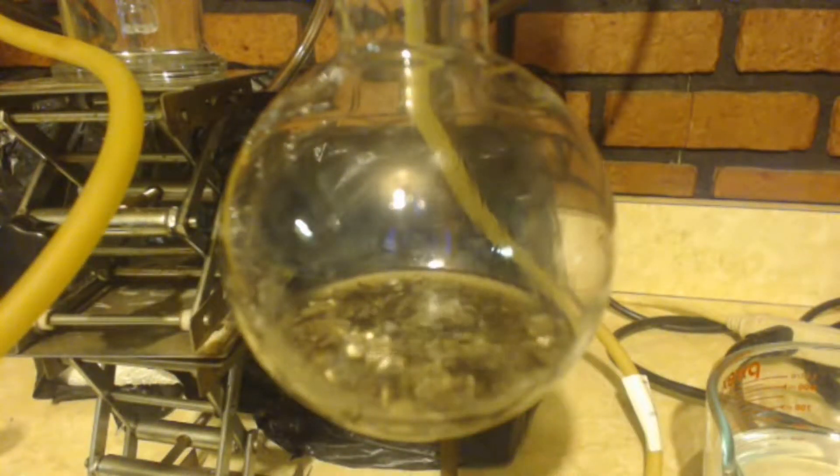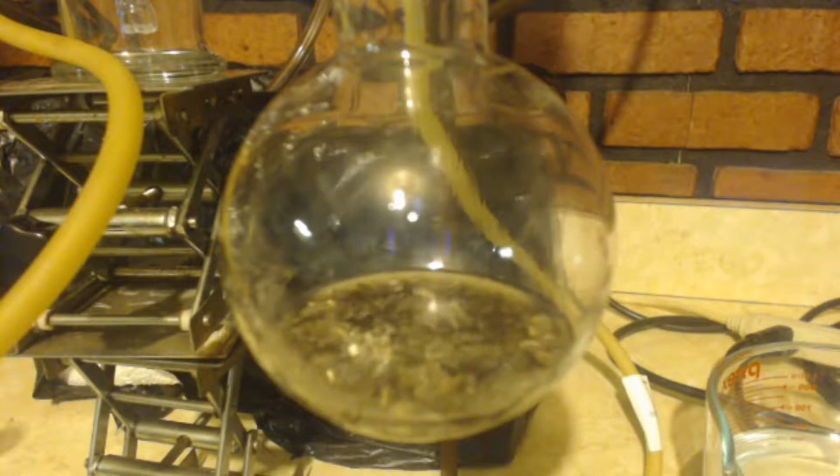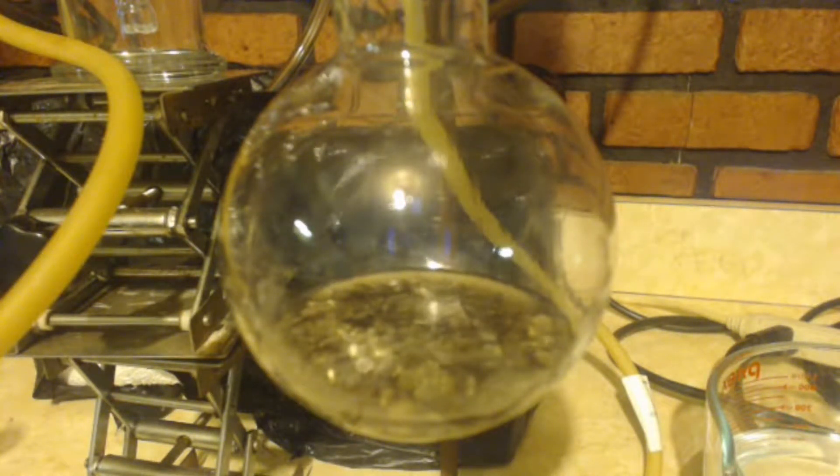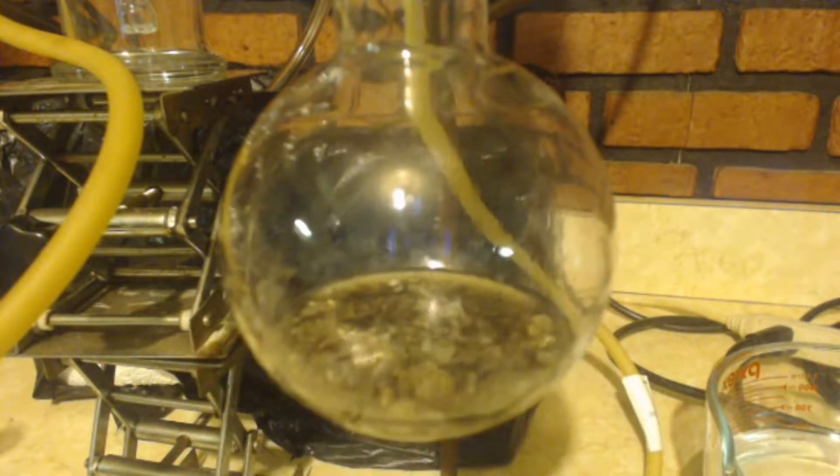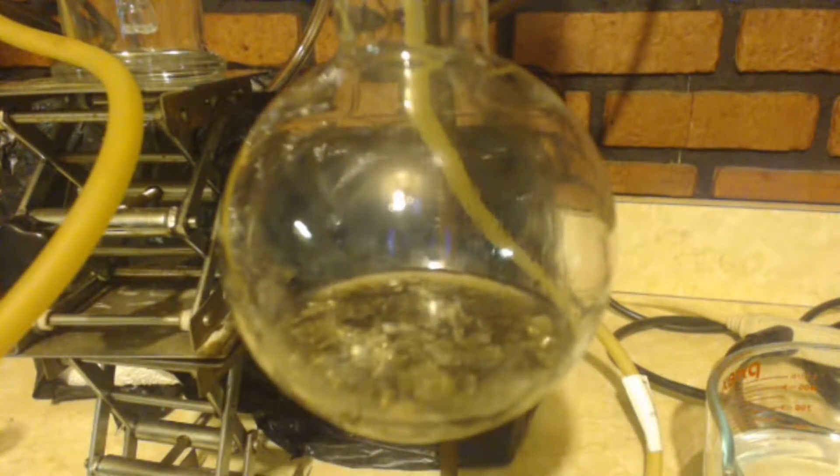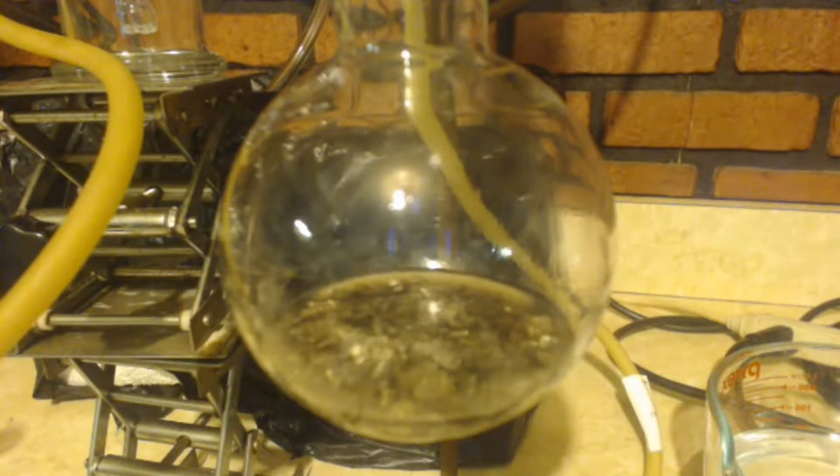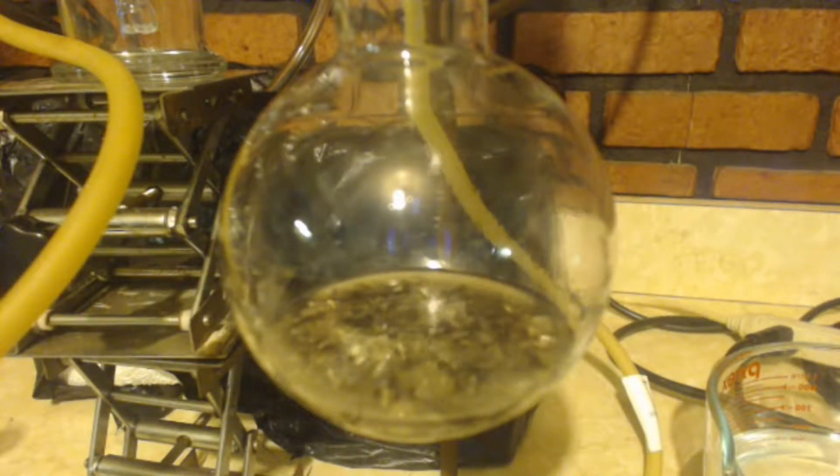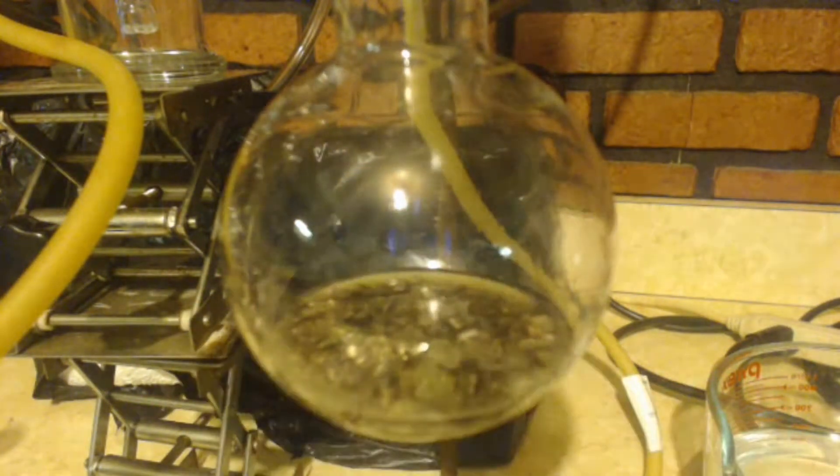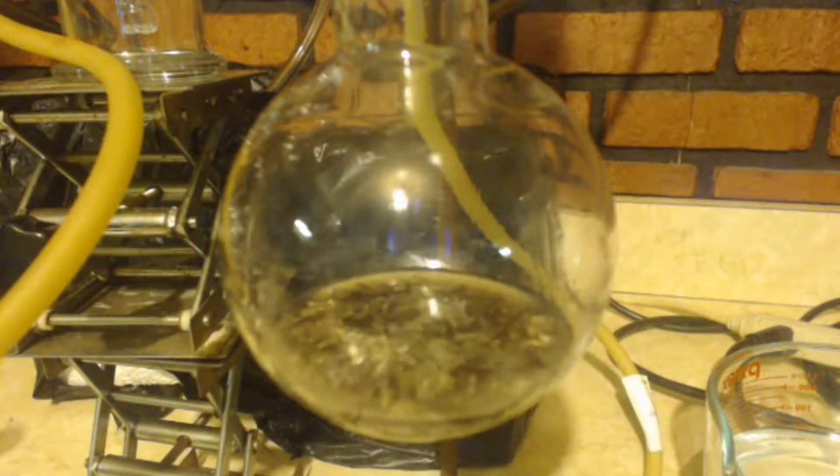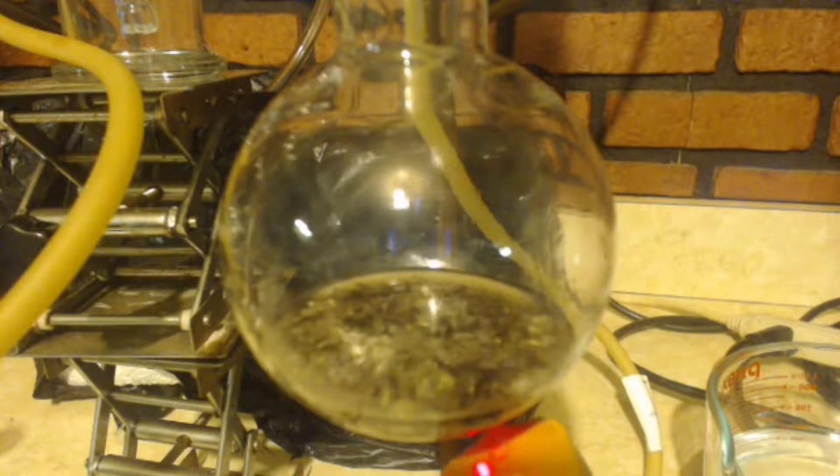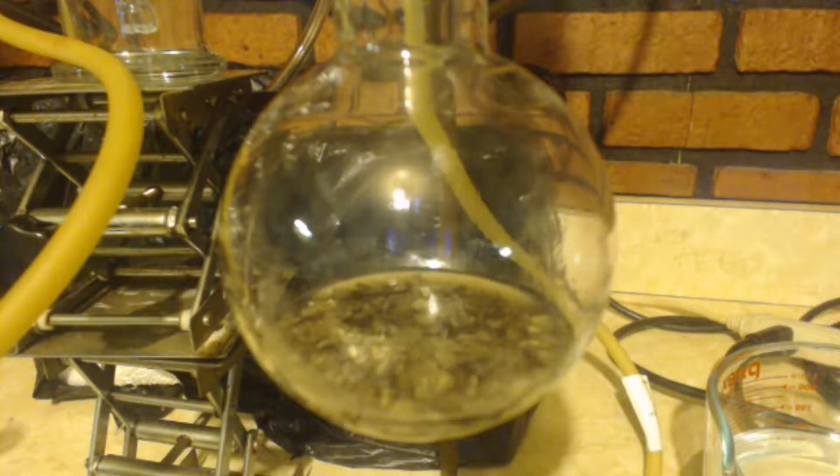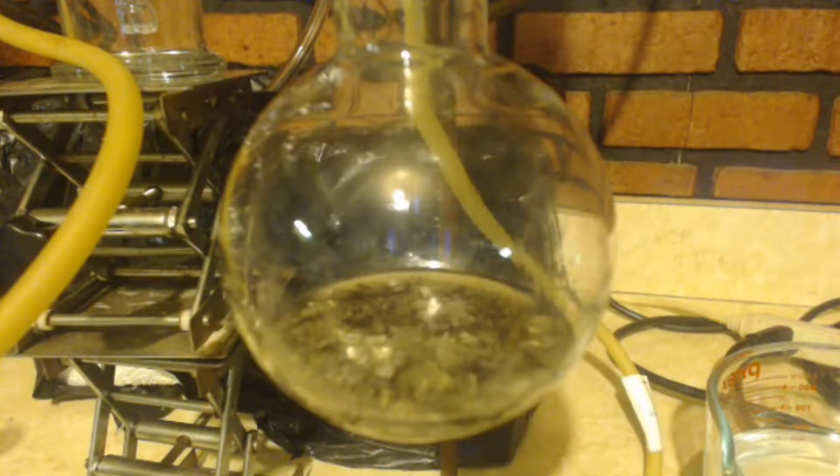It's getting up to 46 so I just shut off the addition funnel. I'll wait for it to cool down a couple degrees and I'll start it dripping again. I can definitely see how this would get out of hand. When I first started, if I had a big amount there I would have bumped all my ether out of the apparatus, that's for sure.